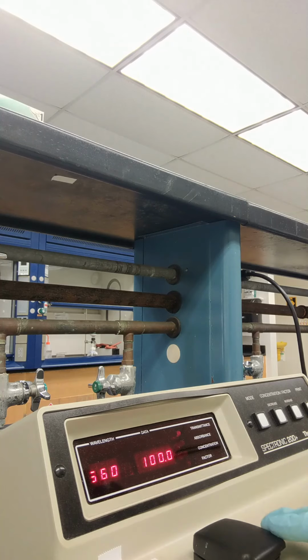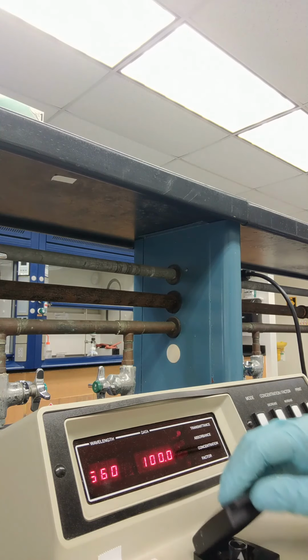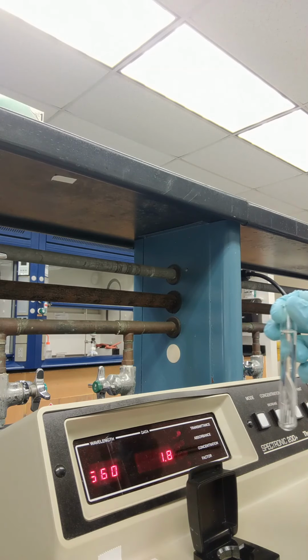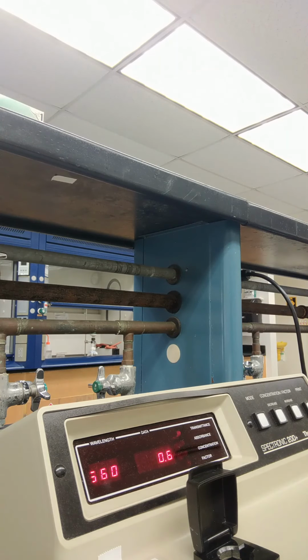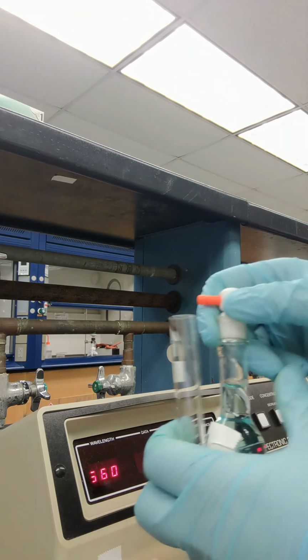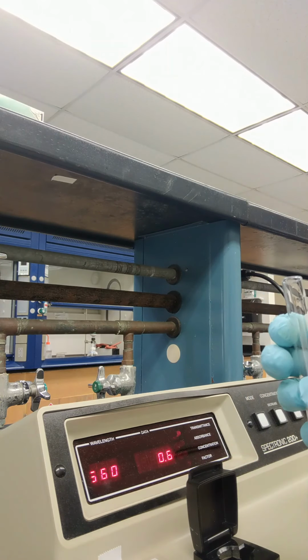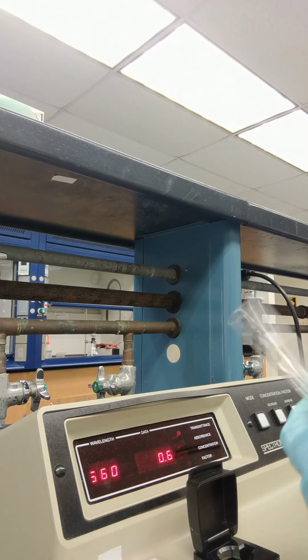So the spectrophotometer is ready. I'm going to remove my blank here, which is just the water, and I'm going to transfer my sample into the cuvette, and then I'm going to put that in the spectrophotometer.